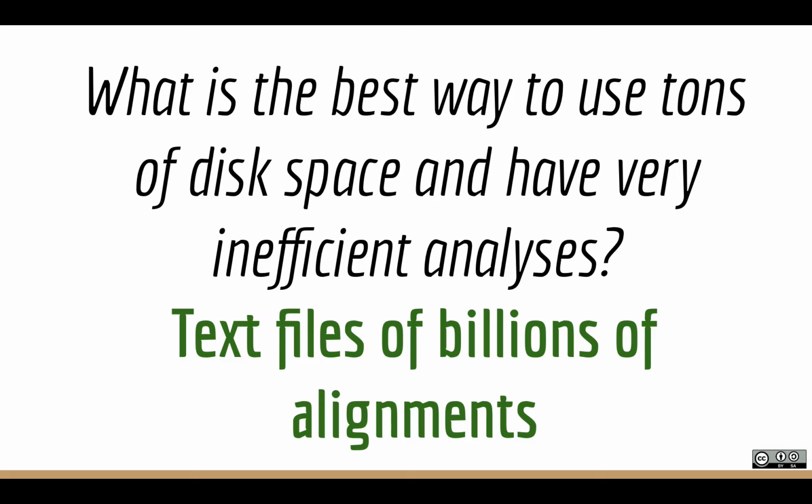Okay, so we've talked about SAM format. If your insidious goal was to use as much disk space as possible and ruin your lab's server, store everything in SAM format. Your PI will love you. You'll have to be buying hard drives all the time. So the original version of this format was text only, and that's because the throughput of the technologies actually wasn't all that high. I mean, they were high relative to ancient technologies, but you were getting like 10 million reads, and you got a 10 million line text file, big deal.